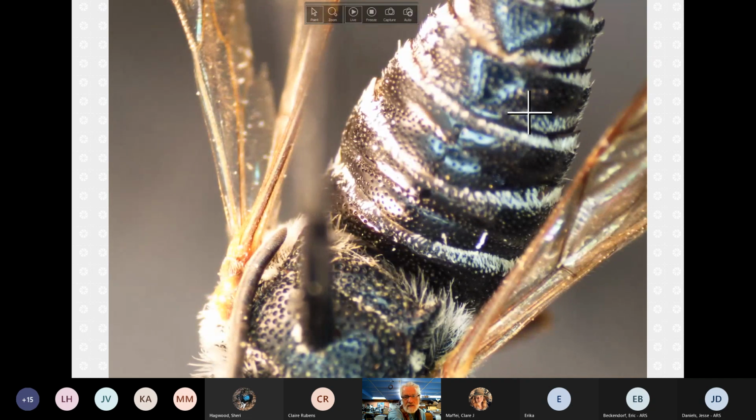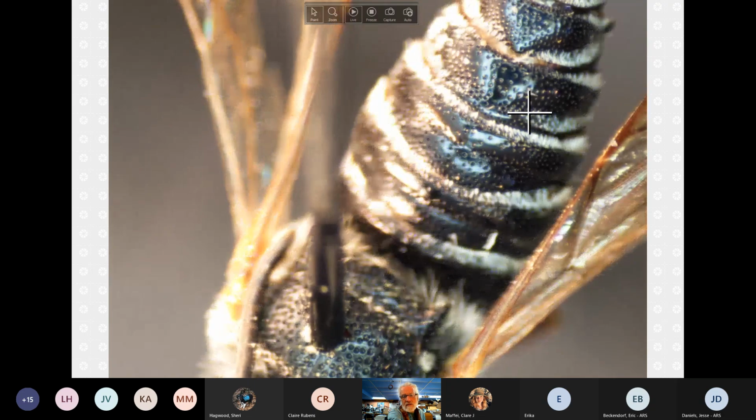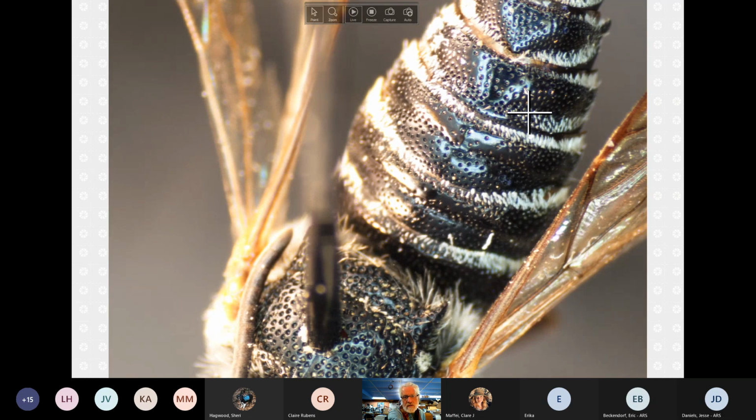Focus, please. Again, an oddly slow refresh rate. All right, orienting. T1 is here. This is the rim of T1. This is T2. This is the rim of T2. Here's the groove running through here, and you can see pits lining this whole way.